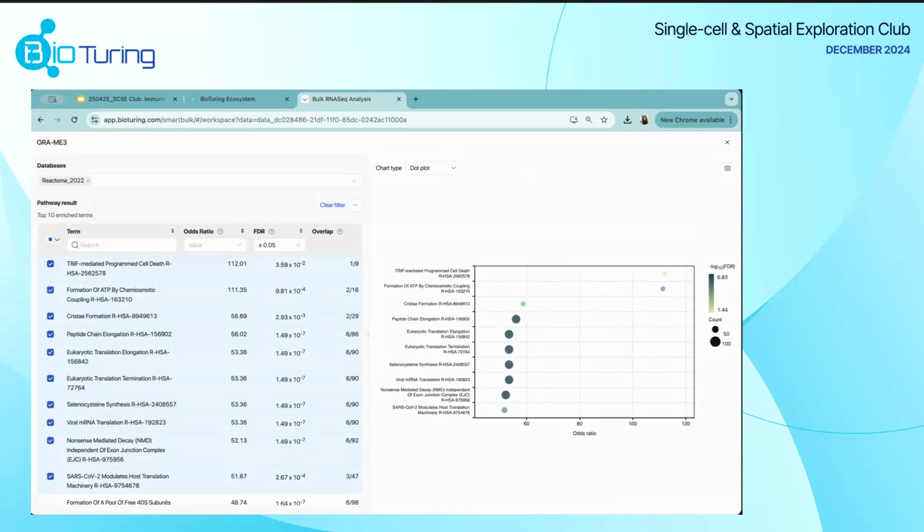We can see that there's a higher transcriptional and translational activity, particularly looking at signals relating to proliferation and protein machinery that might lead into this recovery post stem cell transplantation that might form more granulocytes. We can also see that there's a match in the mitochondrial metabolic activation as well within this ME3 module from the network analysis.